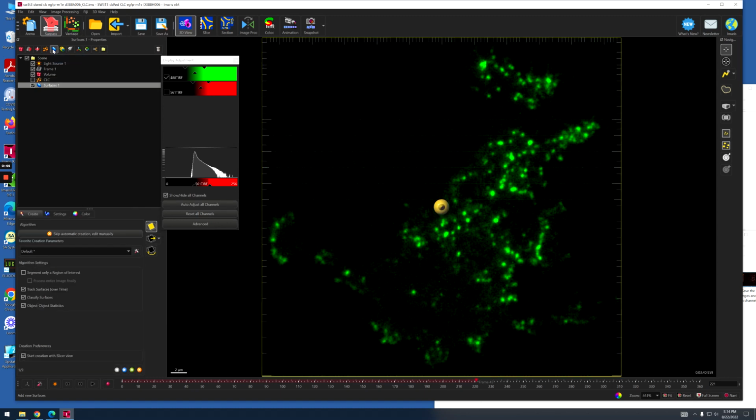The reason that we create the surface module instead of the spot module is that the surface module would detect a region, and all the pixels are averaged out with the background, so it detects an area that is bright. If the spot module only detects the center pixel that is super bright, and the background is relatively dim, then it would see it as an object over there.